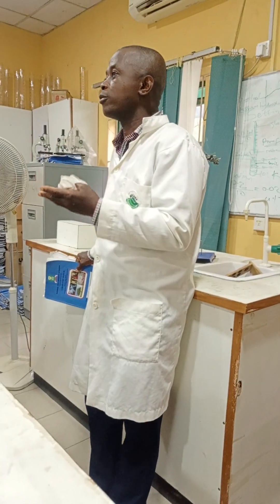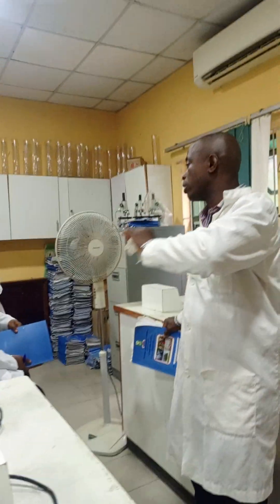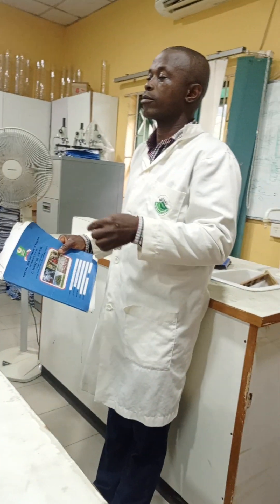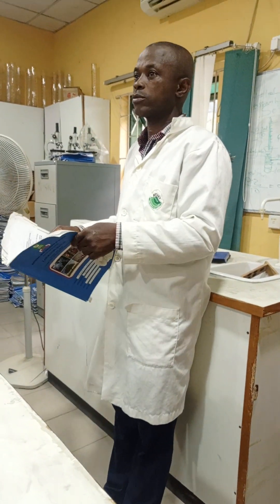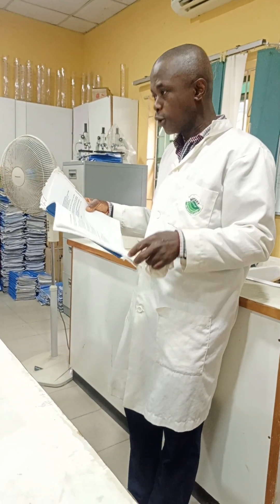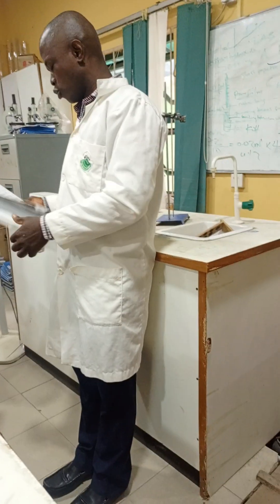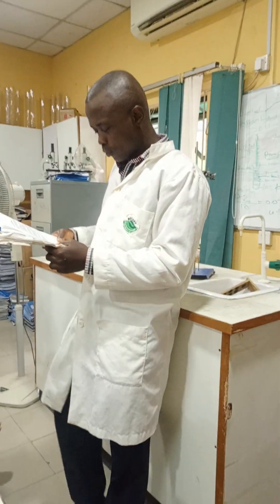You don't eat in the lab, you don't drink in the lab. If you want to use any equipment in the lab, you must take permission. You don't smoke in the lab because some chemicals might be ignited by the flame, so no smoking in the lab.